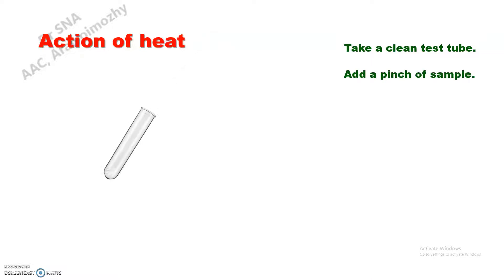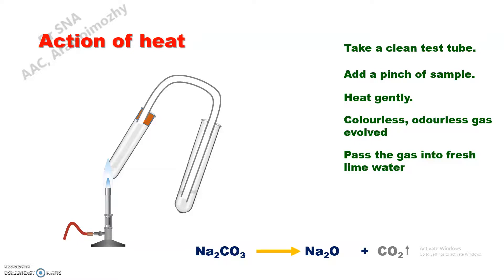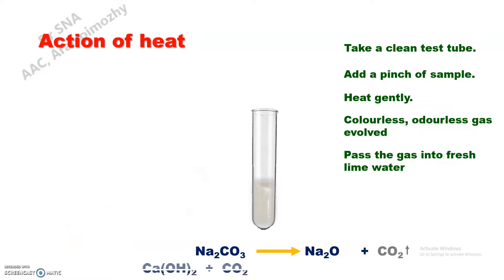Now heat it gently. A colorless, odorless gas — that is carbon dioxide — is evolved. To identify whether carbon dioxide gas is evolved, we pass the gas into fresh lime water in another test tube. We can see this lime water turning milky due to the formation of calcium carbonate.